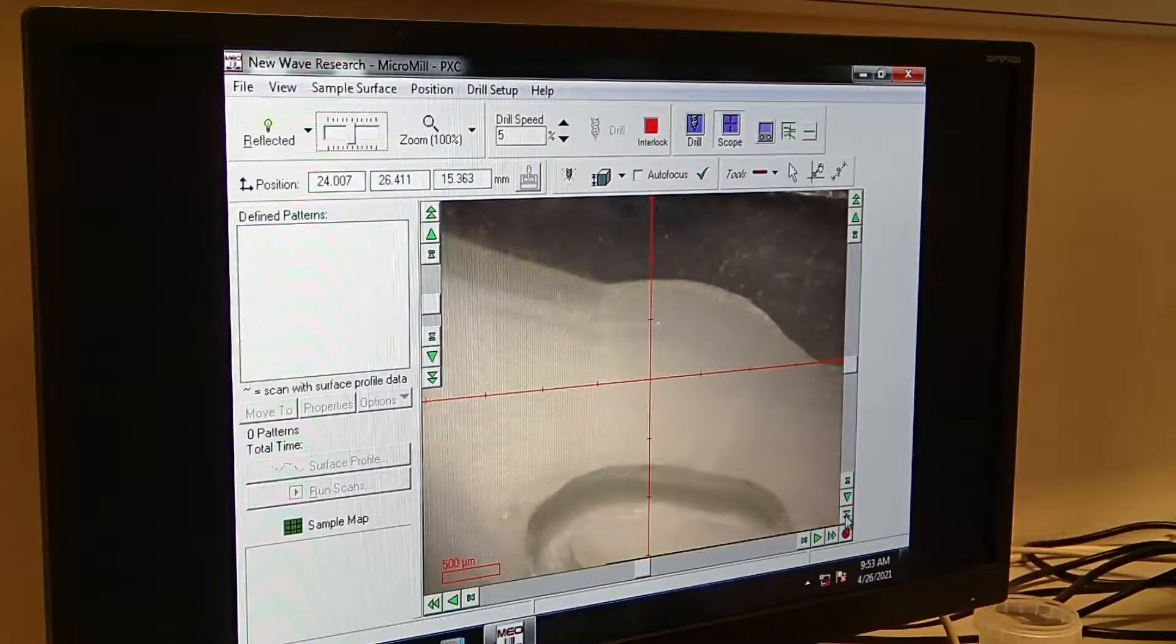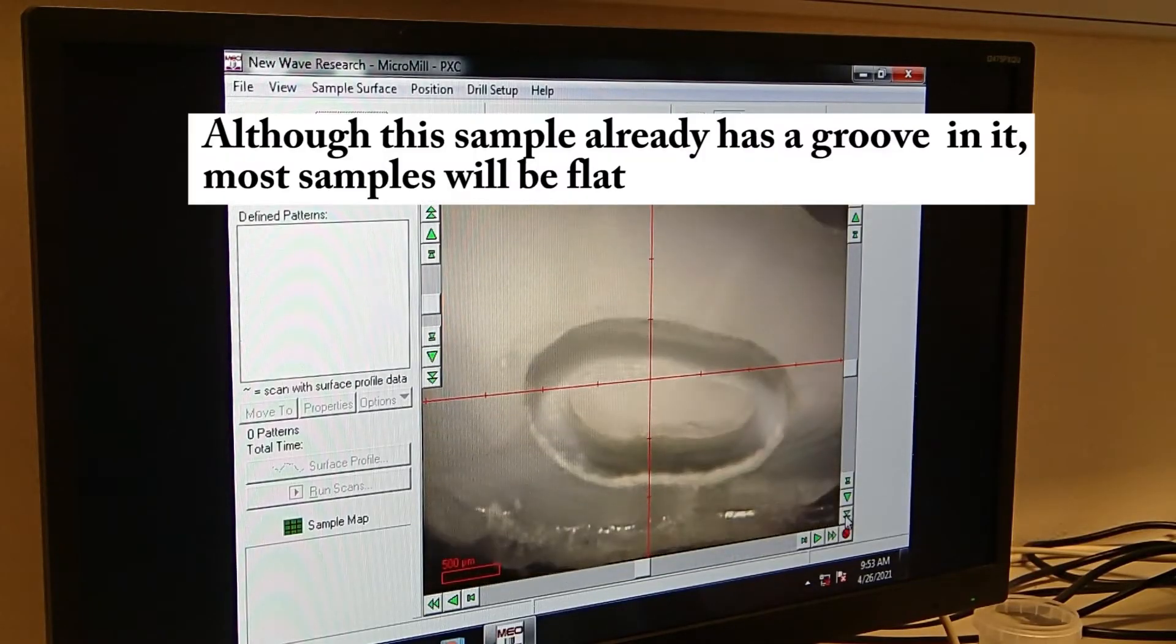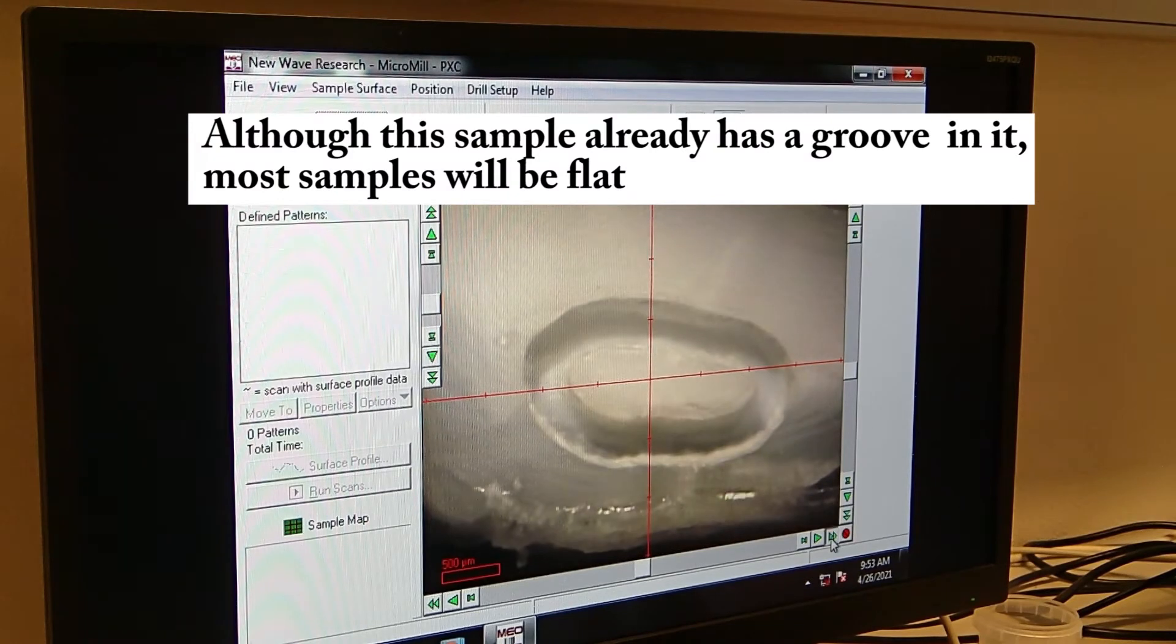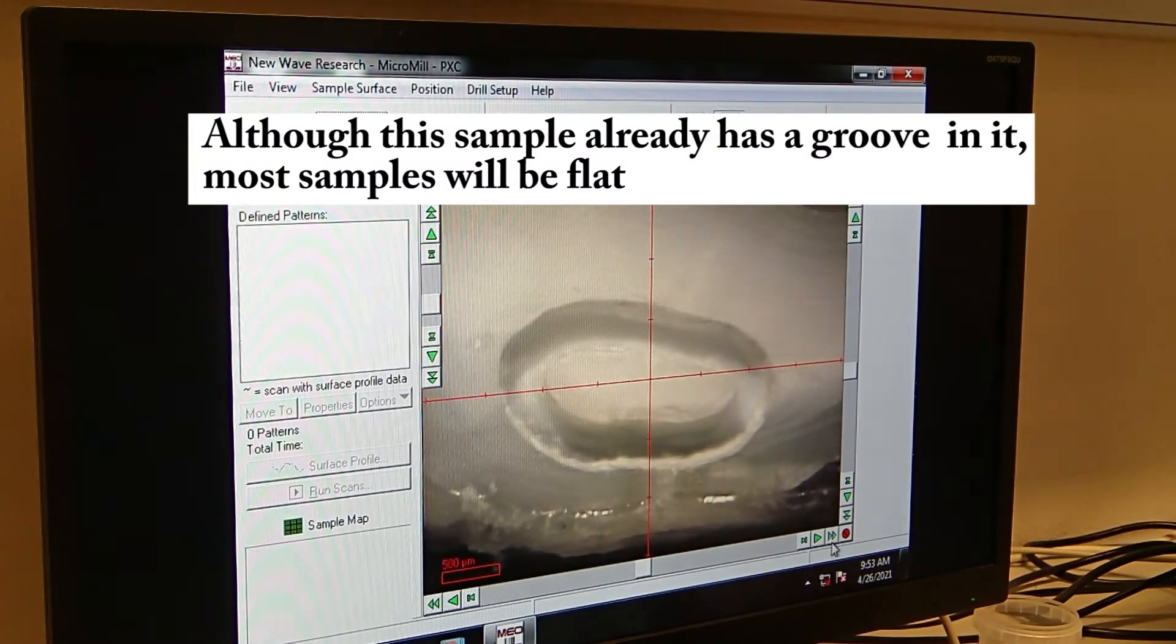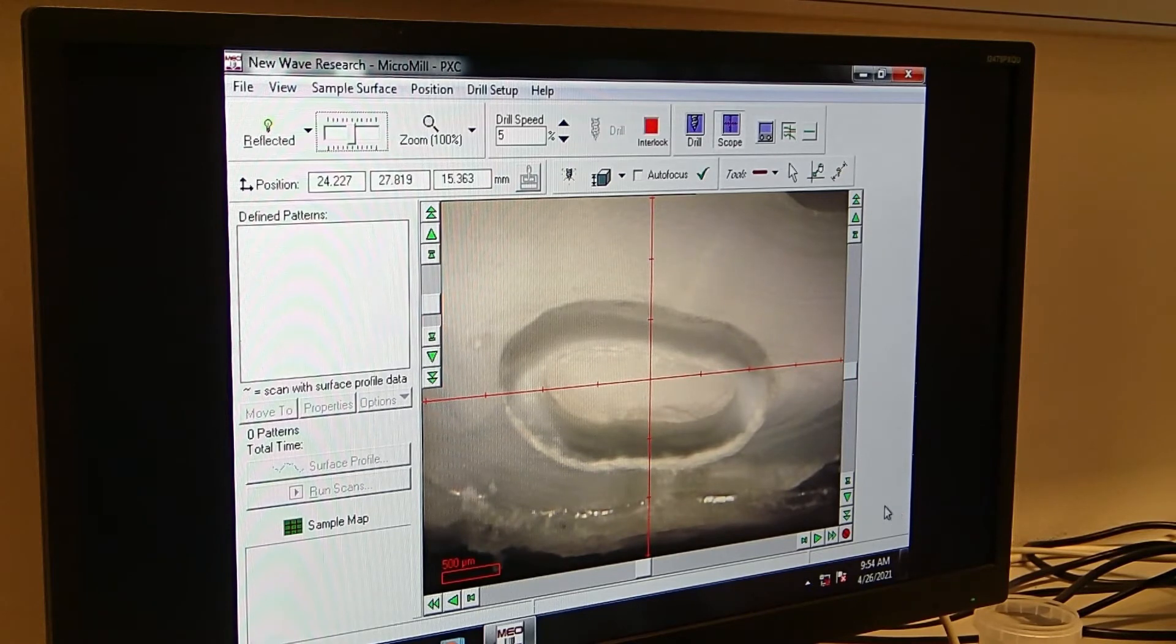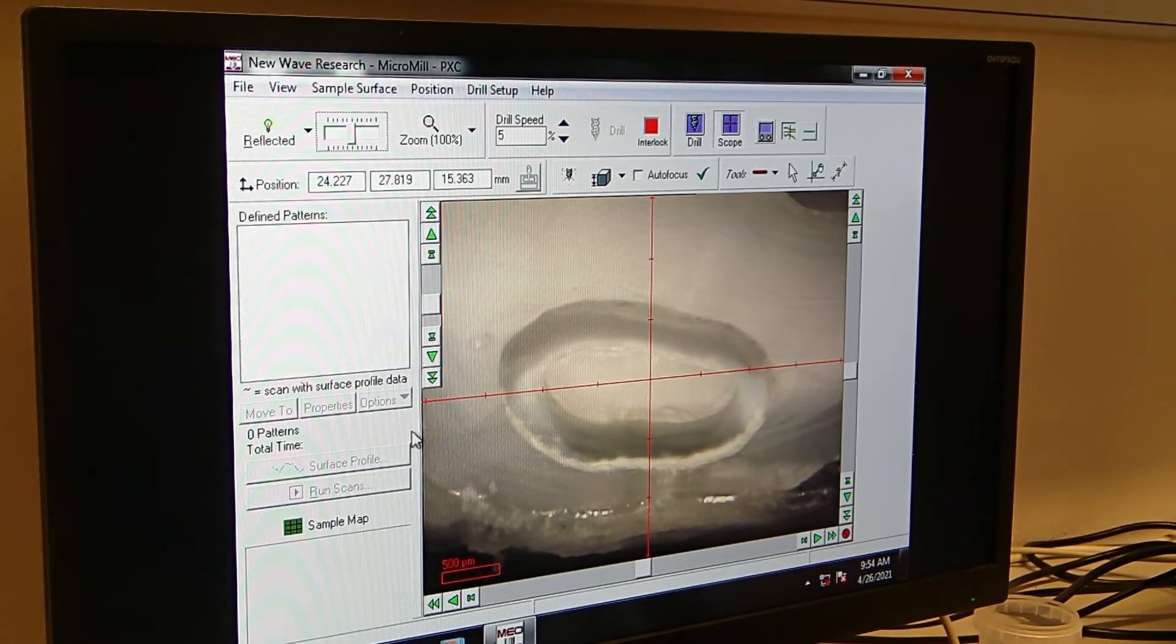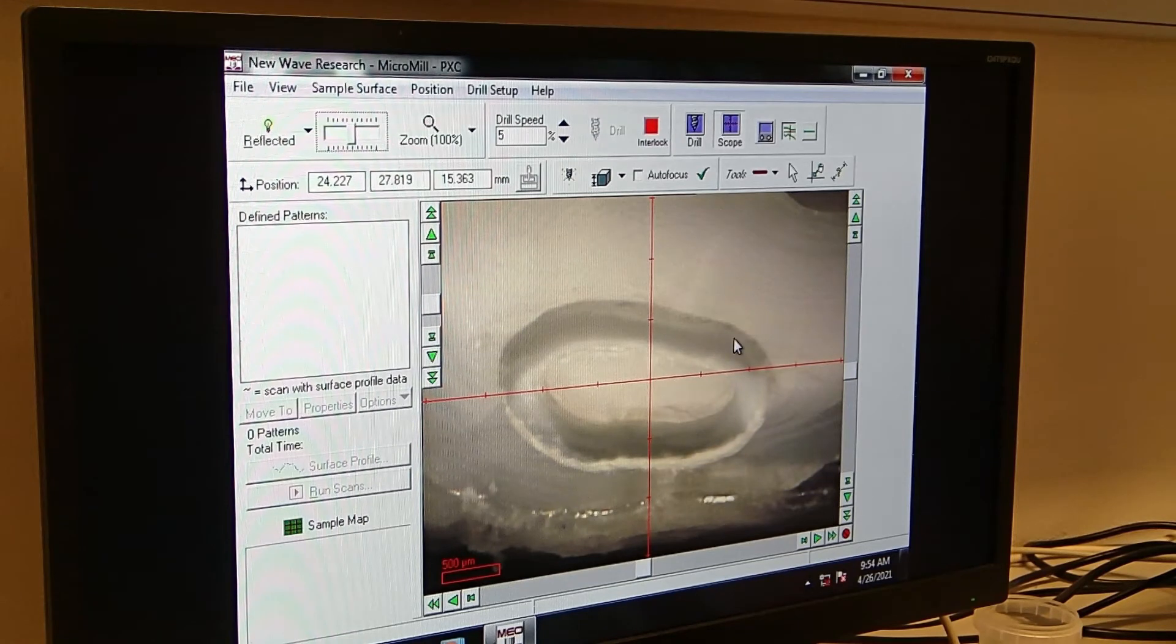So now we are setting up the drill path. Imagine the sample hadn't been drilled before. So what I do is setting up the drill path. So here we are interested in drilling the core of the autolid.